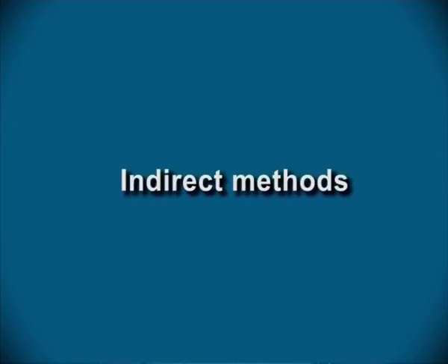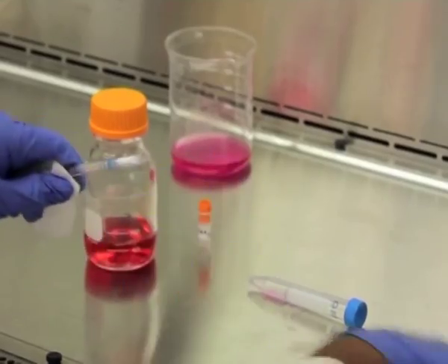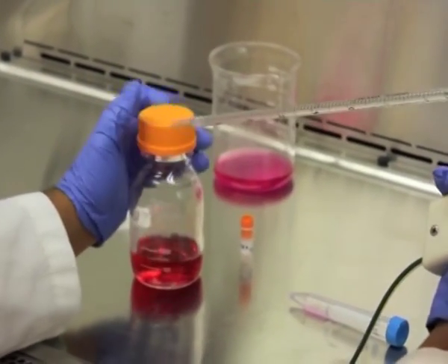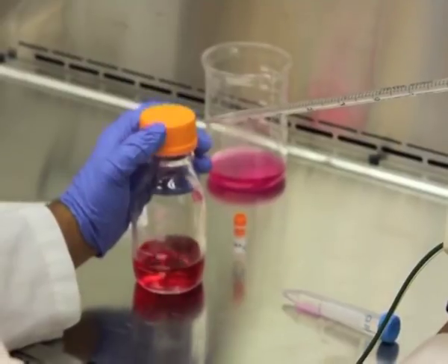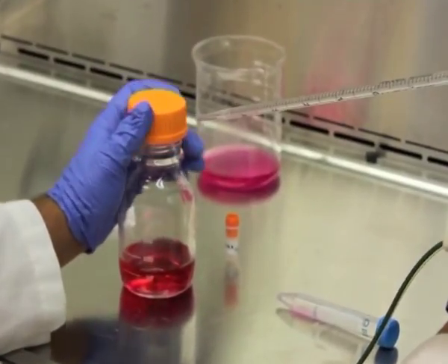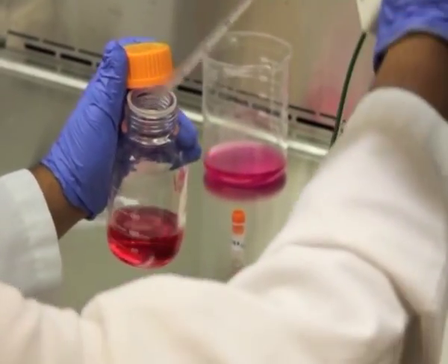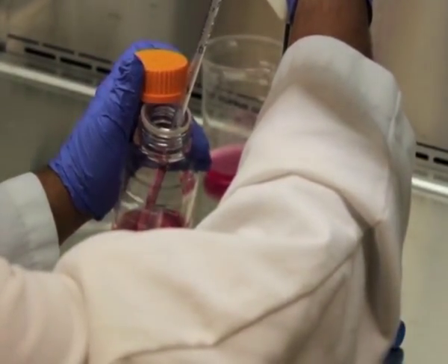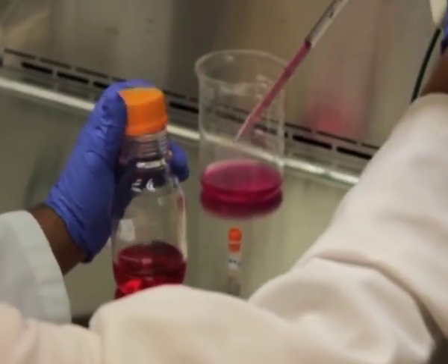After the direct methods, let us learn about indirect methods. Indirect count is made by growing microorganisms in liquid broth. As microorganisms grow, the broth becomes cloudy or turbid. The turbidity is measured using a device, that is a turbid meter or colorimeter or spectrophotometer.